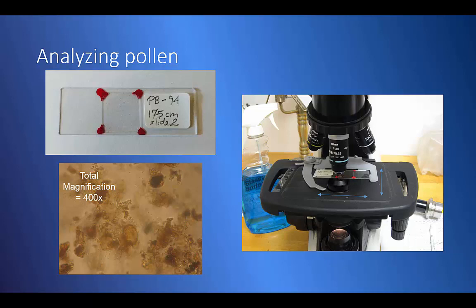Grains can be turned at different angles, damaged, or covered by other organic material. Here we've got an elm grain on its side, a hazel grain with some algae on top of it, and a birch grain covered by a piece of charcoal.